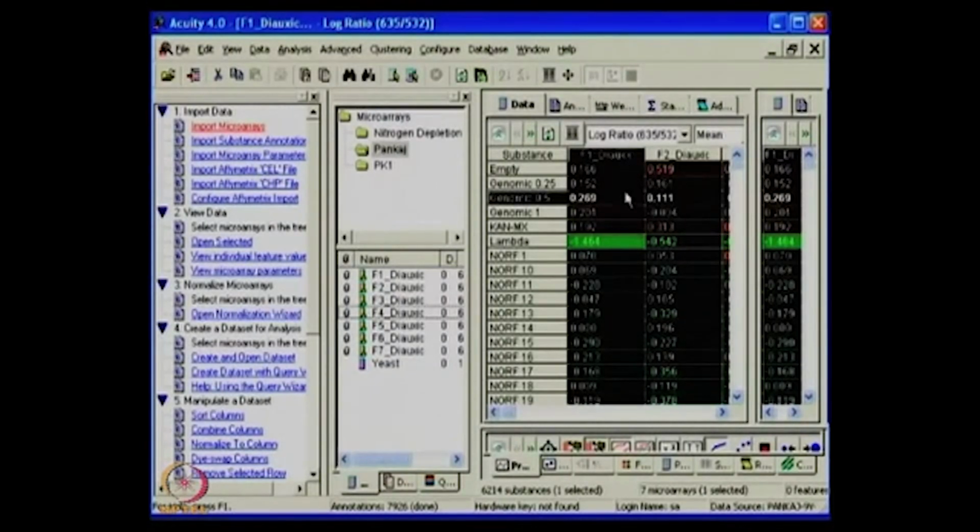Yeah. One way to look is at the numbers, which is a little cumbersome. The other way people like is color. If you carefully observe, the coloring scheme here is red, black and green. Yeah, maybe you can tell that it's a conventional theme for microarray, right? People always represent these colors. So what does each of these color codes mean? Correct. So the black color is towards 1.